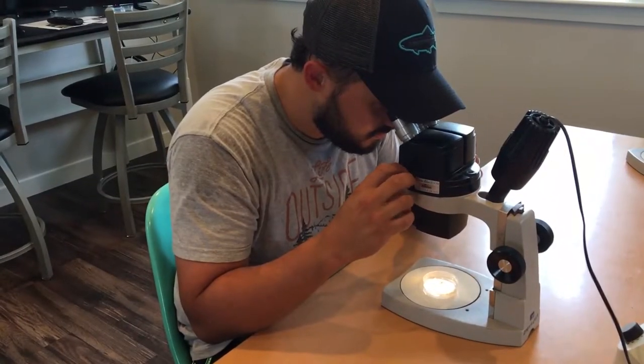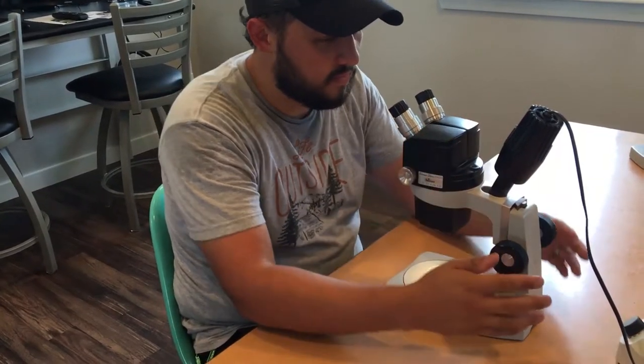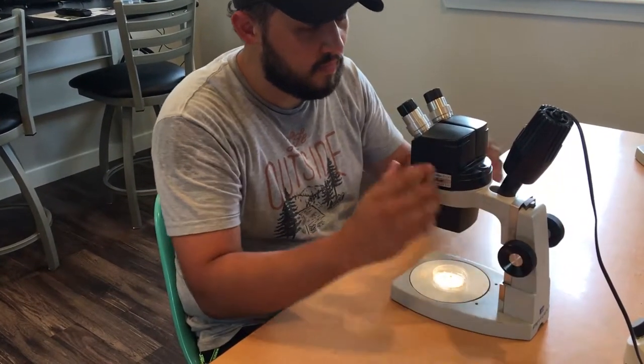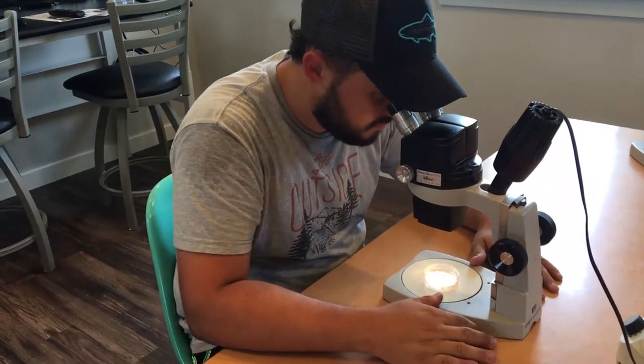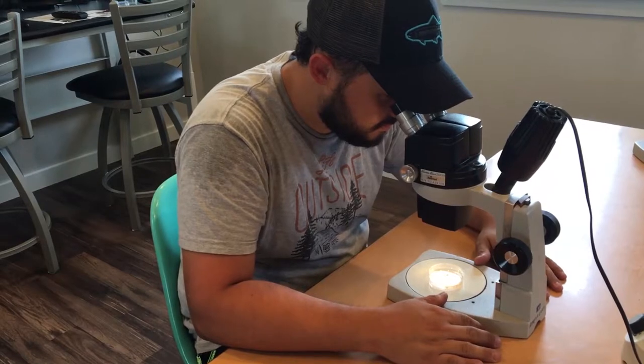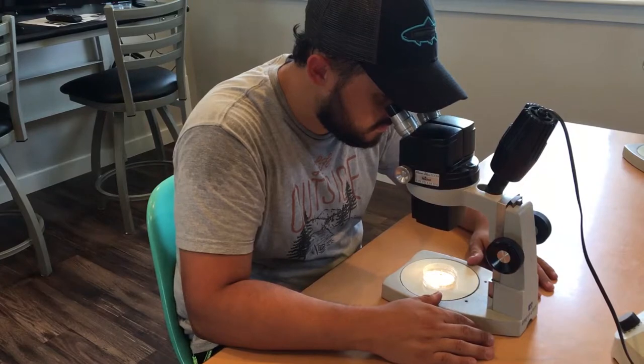So far we've talked about three adjustments: the ocular adjustment for your eye width, the focus knob for focusing, and the magnification knob. If everything is working right, you should be looking through the microscope with both eyes open and seeing a nice clear image once you have the focus adjusted. If not, ask for help from the instructors.